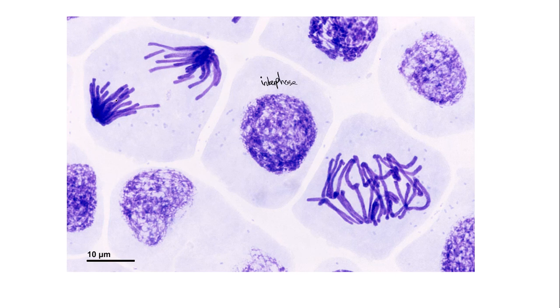In this step here, as you can see, the spindle fibres are pulling apart the chromosomes by the centromeres, so we can say that this is anaphase. In this stage here, the chromosomes are kind of at the equator of the cell, which means the middle of the cell, just about starting to be pulled apart. So this could be metaphase.